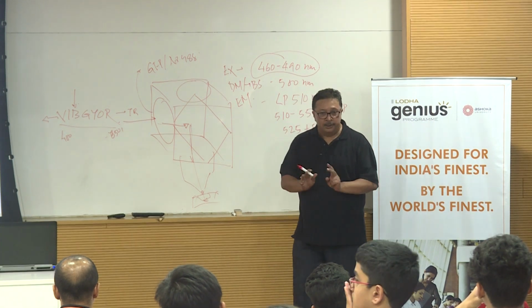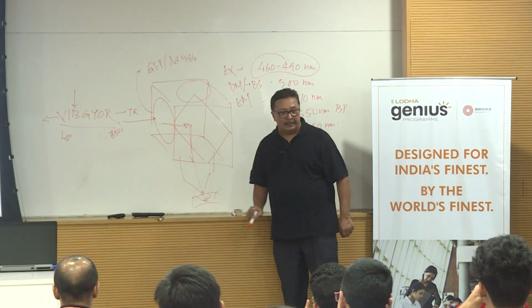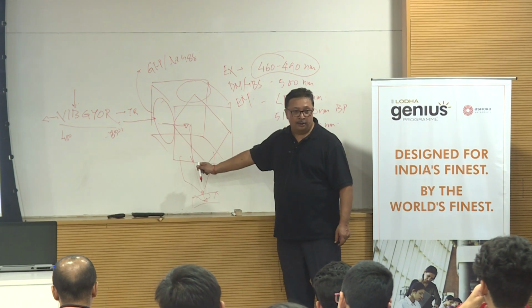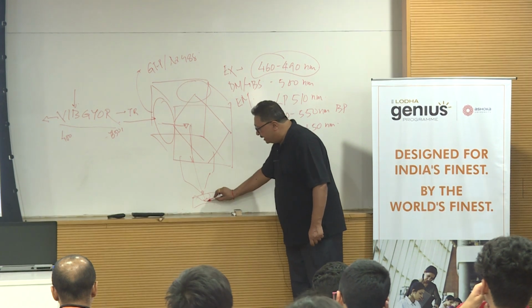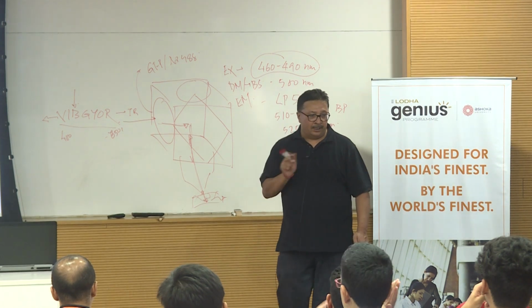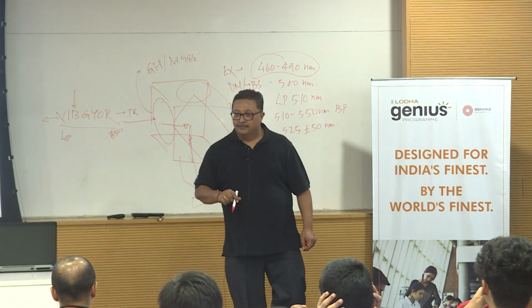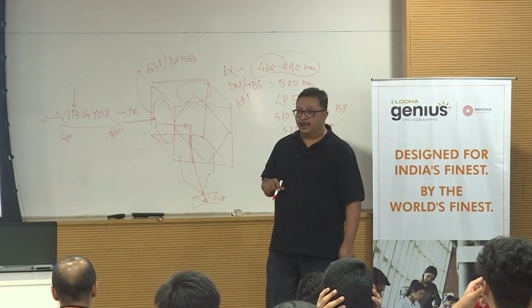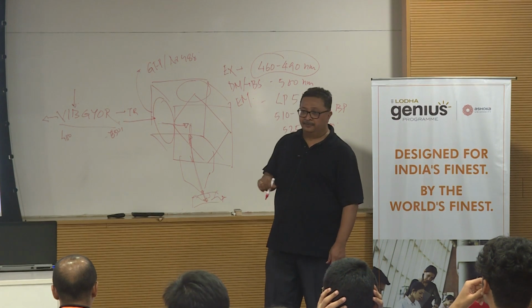Some work function loss, energy loss will happen, some absorption will happen, and the remaining energy, meaning lower energy than the excitation or the incident light, will be transmitted or reflected back. So lower energy means higher wavelength, and higher energy means lower wavelength.